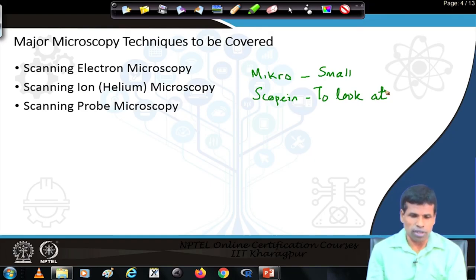This is the middle word coming, that is, probe. If we use a physical probe, like a blind man does, he uses a white cane to locate an object or something that is close to him or her. Similarly, we can use a physical probe to measure the size and shape of an object. So, here you see the middle word, electron or ion probe, coming into the picture of microscopy.